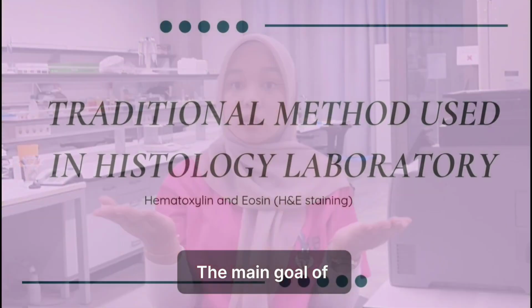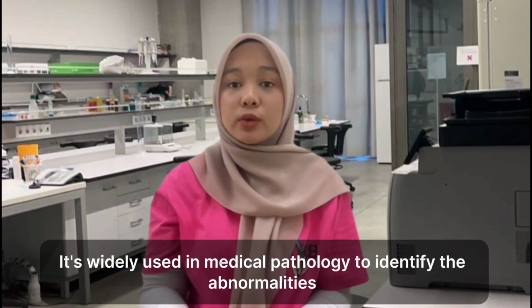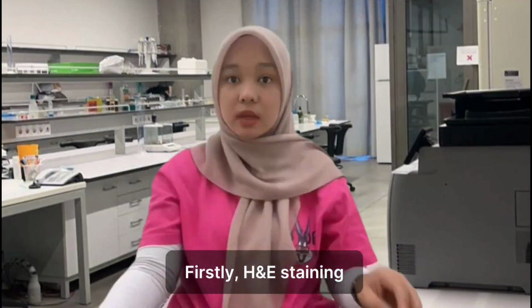The main goal of H&E staining is to help differentiate cellular and tissue structures. It's widely used in medical pathology to identify abnormalities in tissue, like cancer and disease.